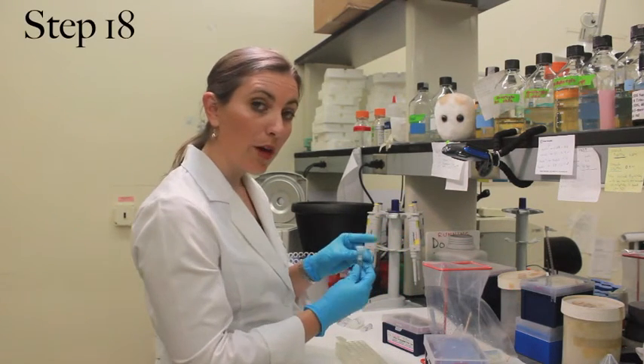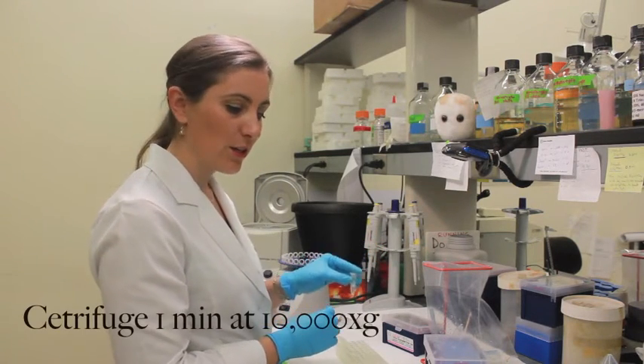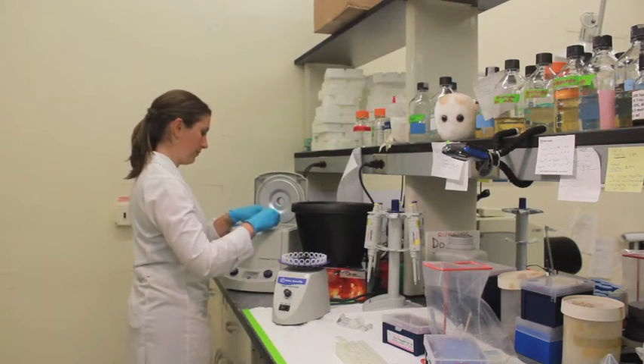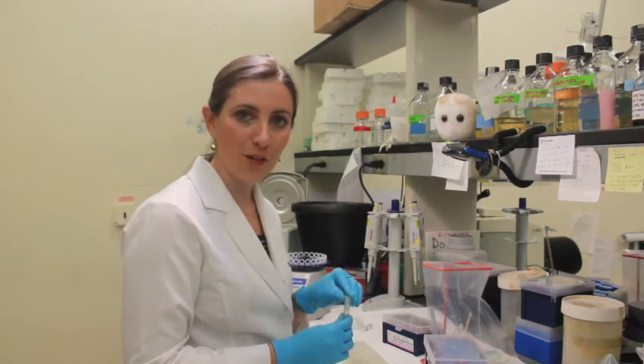On this step, we want to make sure that there are no residual chemicals left on that spin filter. So without adding anything to that spin filter, we are putting it back into the centrifuge for one minute. When you take it out of the centrifuge, you may be surprised to see that there actually was a fair bit of liquid remaining.